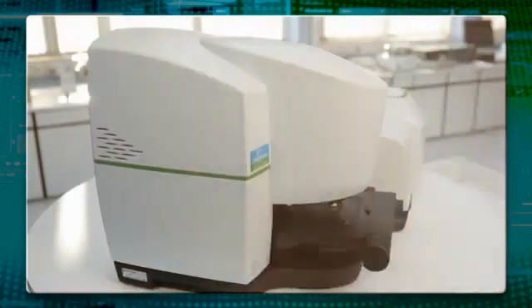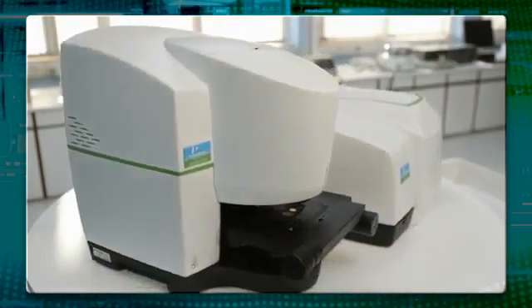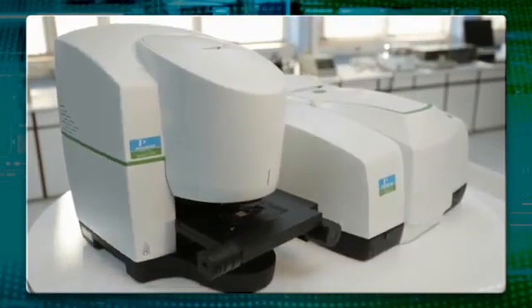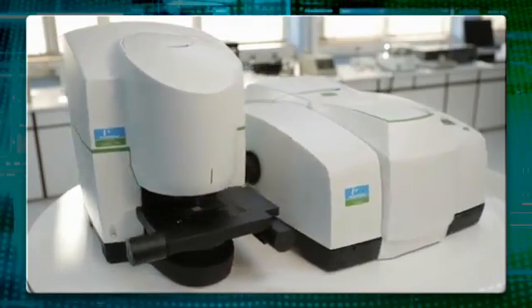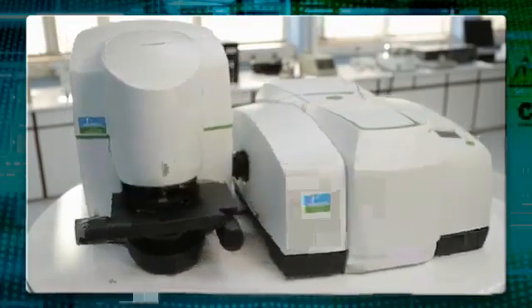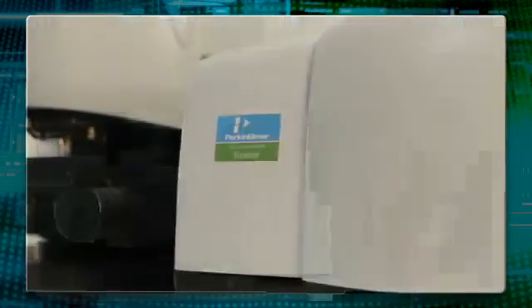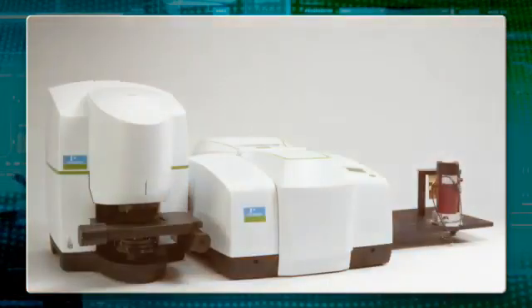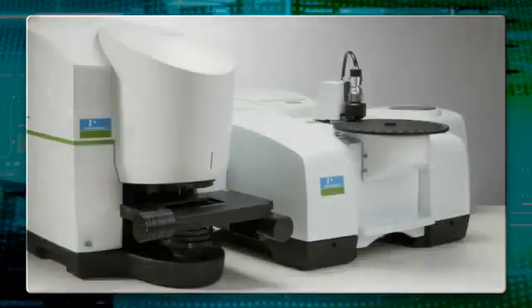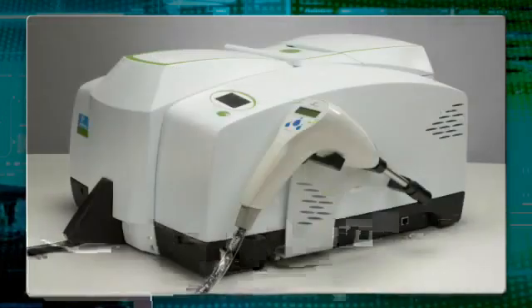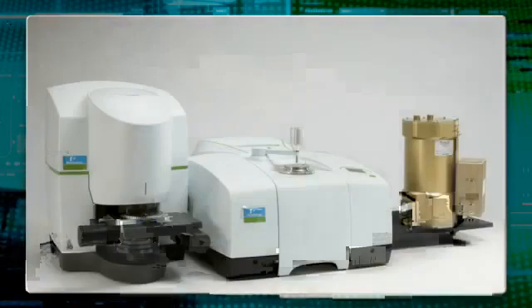Or with Frontier for the highest levels of FTIR sensitivity and configurability, with an extensive range of sampling and detector options. Frontier has a fully flexible optical system, extendable to near IR and far IR for macro-samples, with a broad range of high-performance plug-and-play accessories that can be added as a scientist's research evolves.